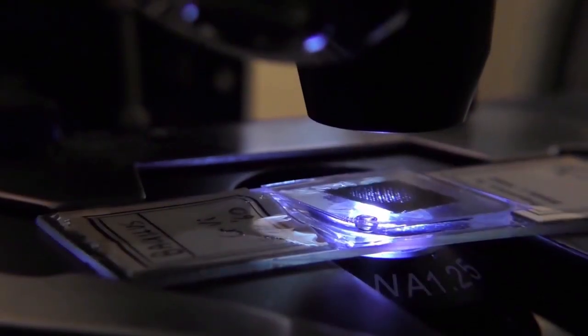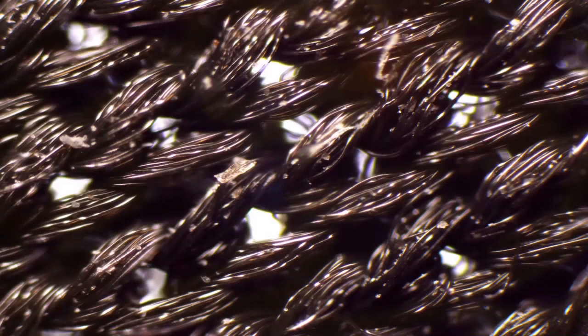Increasing the magnification to a hundred times, we can clearly make out the polyester fibers from which the mask is manufactured.